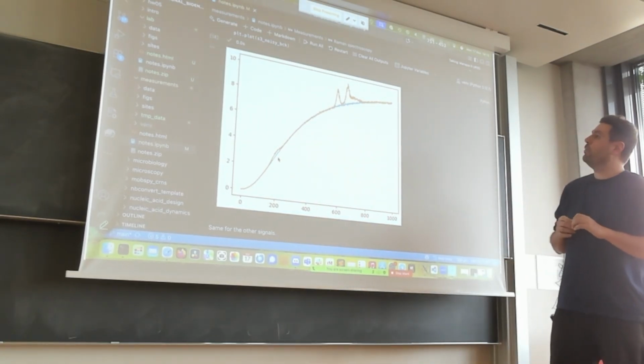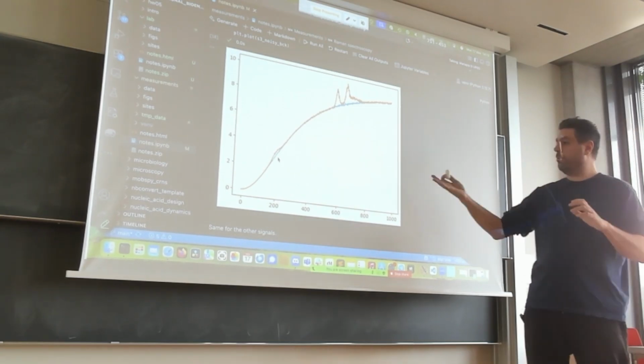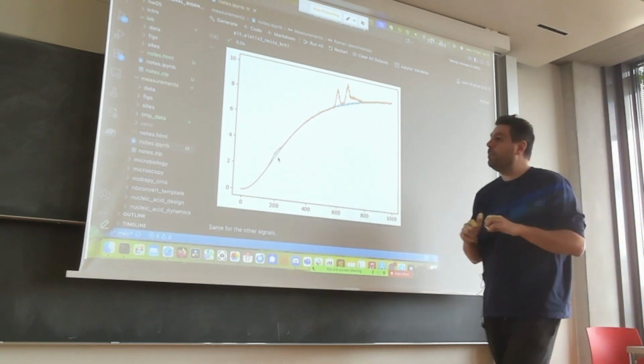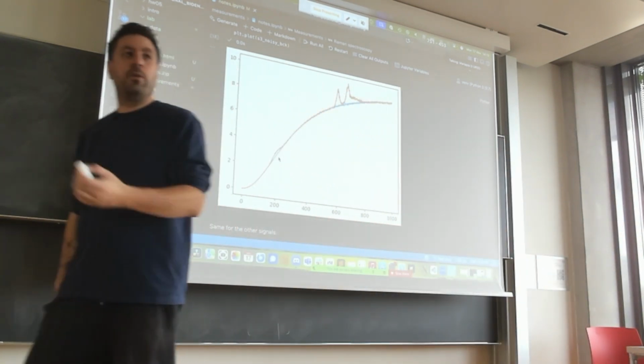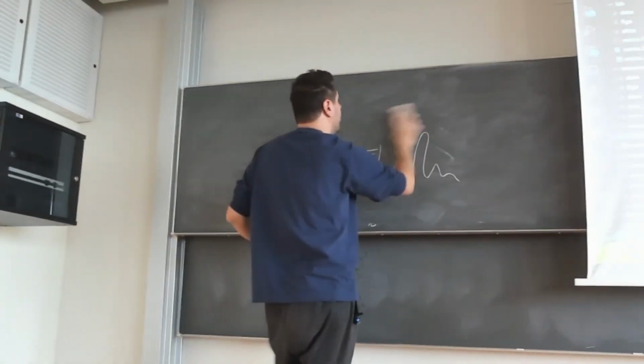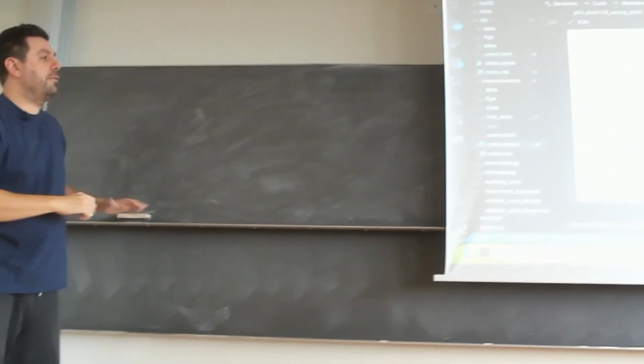The only reason why I want to show you this is actually because I find this algorithm so beautiful. Or one of the algorithms. There are many algorithms to do this background removal. But I want to show you this principle because perhaps you will use that one day when you process data. Yeah? And this is not specific to Raman. This is in general something you have.